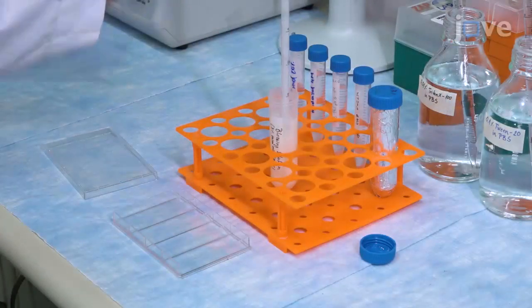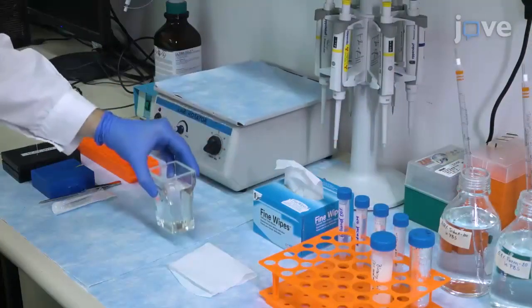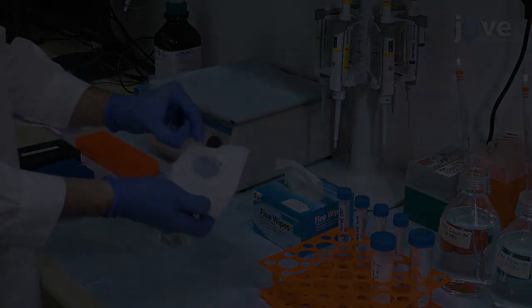Pipette the blocking solution into a plastic box. Then, remove the microarray slide from the Coplin jar. Use a fine wipe to dry the non-DNA side and edges of the slide.